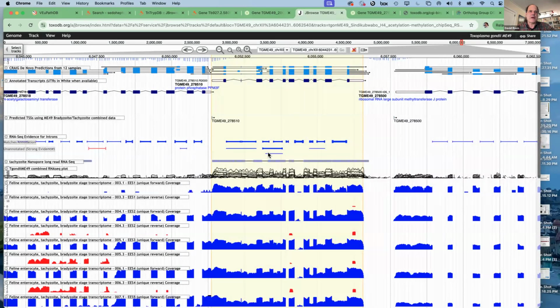So again, despite the fact that there is evidence of exon skip polymorphisms, the abundance of that is very low. Roughly 1,000 reads support this exon skip variant versus 8,000 reads that support the exon inclusion variant. And combined with the fact that this would lead to an untranslatable protein, that means I would be inclined not to annotate this alternative as an alternatively spliced variant.